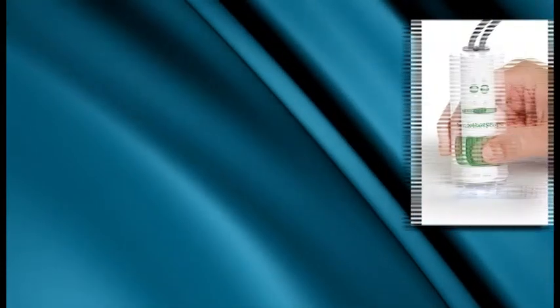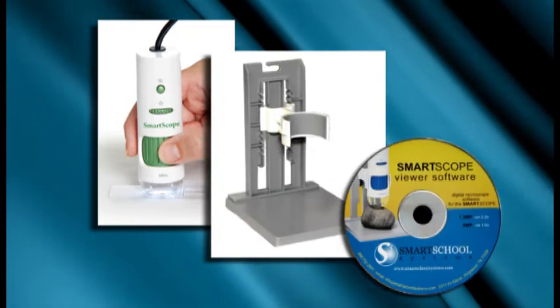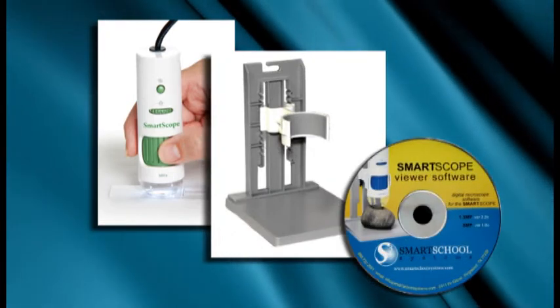Included in the package is the SmartScope 500, the stand, and the software site license, so you can install the software on all of the computers on your campus.